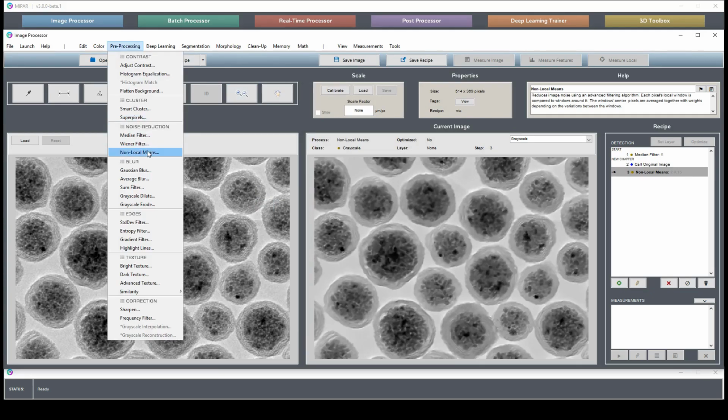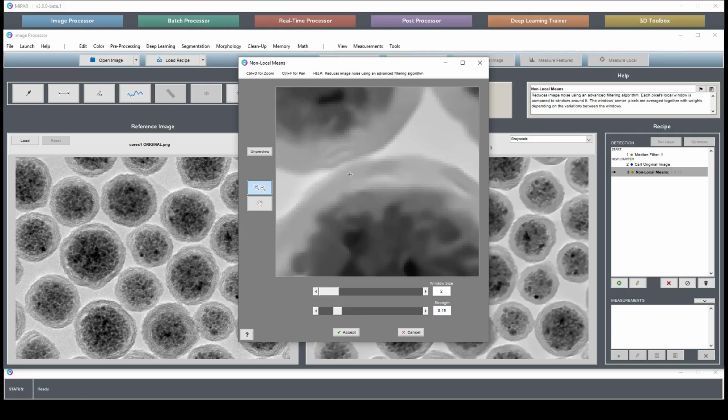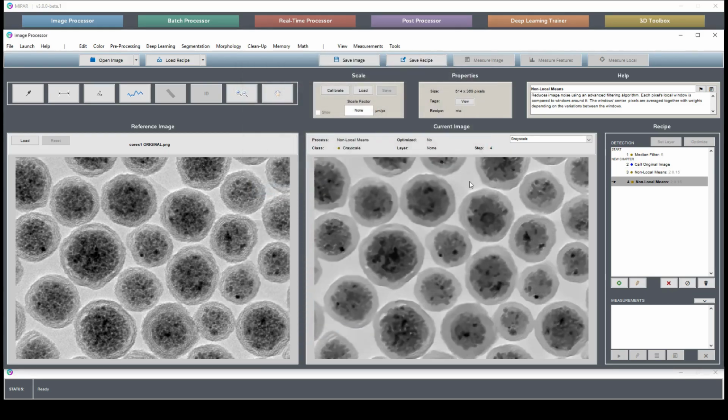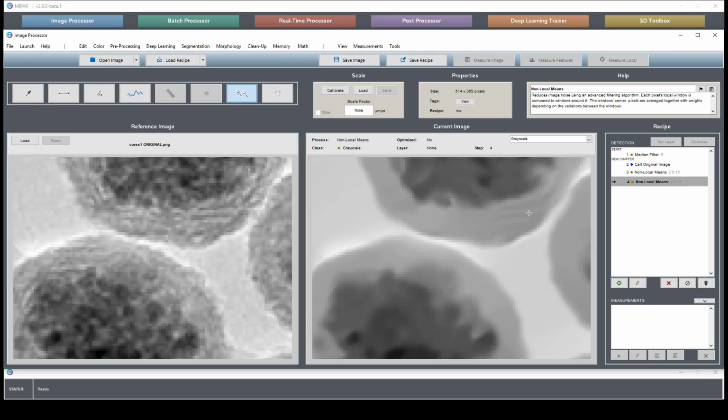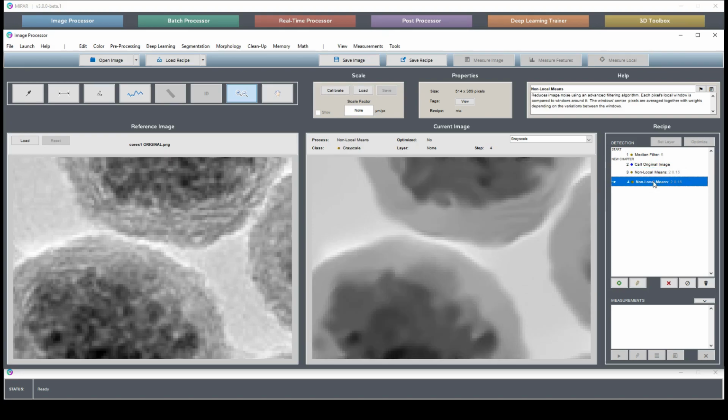And something you can do with the non-local means is actually repeat it to get further smoothing on the fine parts, the small variation, while continuing to preserve the intense variation. So original, first pass, second pass, and we save this really nice boundary here.